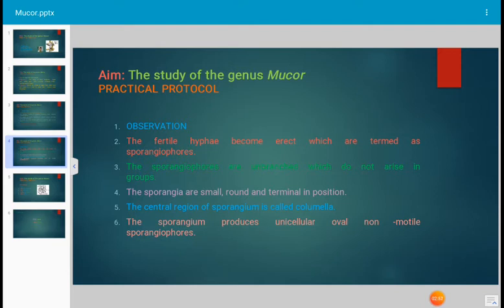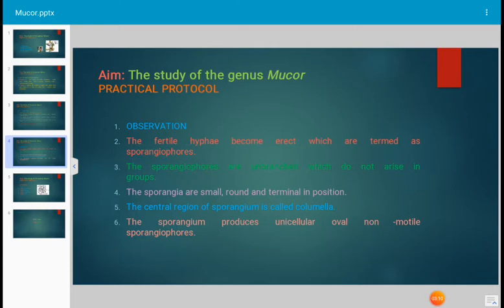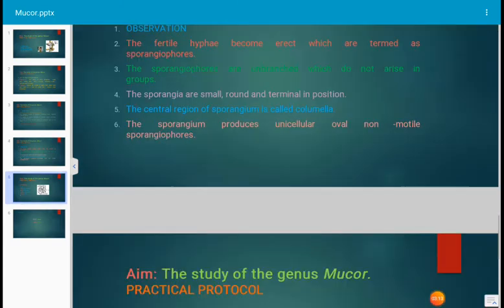The central region of the sporangium is known as the columella. The sporangium produces unicellular, oval, non-motile sporangiospores. These spores are unicellular but they are multinucleated.